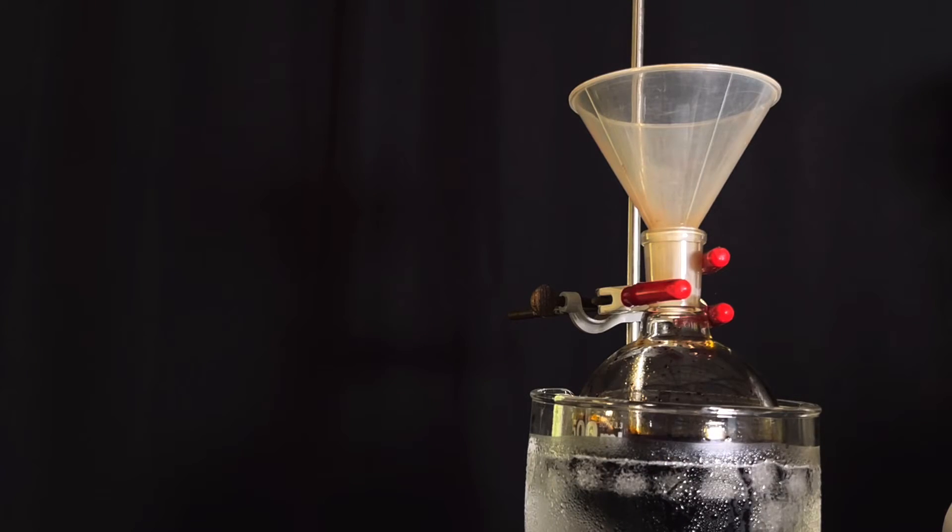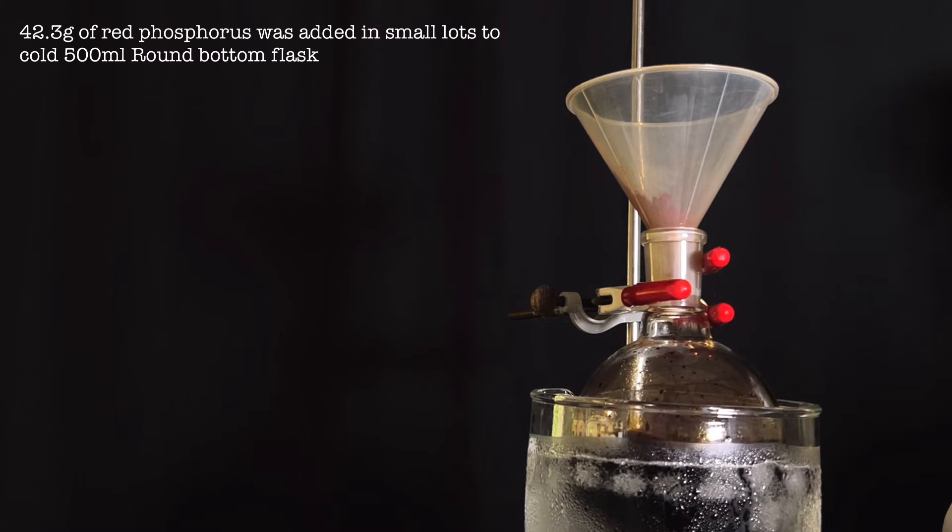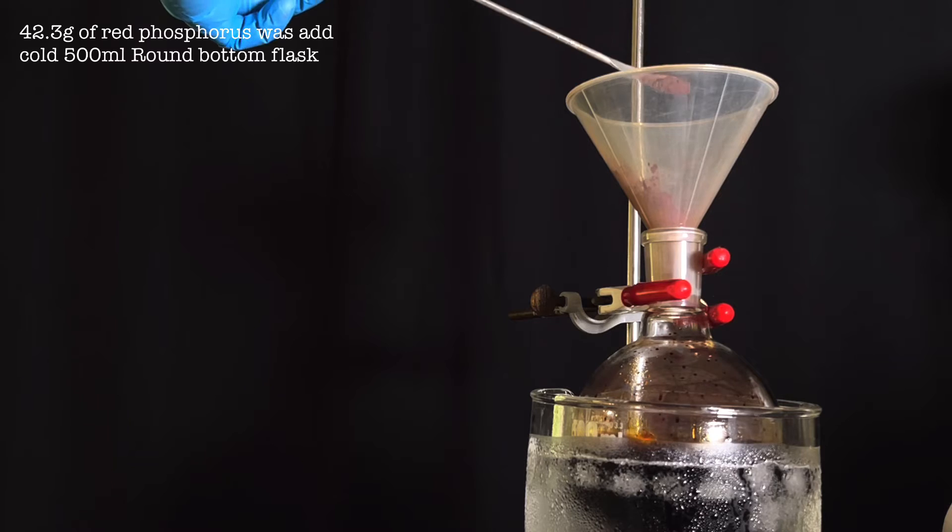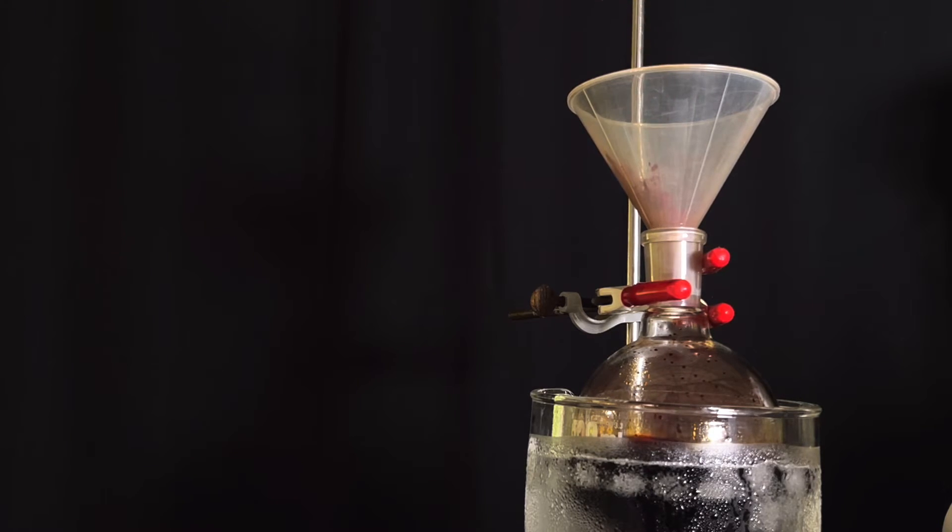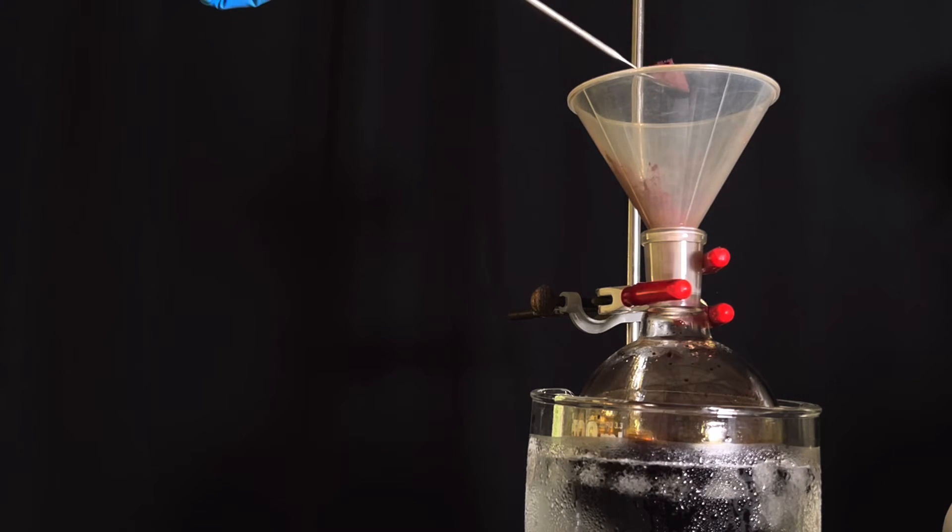Next we start adding the red phosphorus in small scoops at a time. This will immediately start the reaction and the reaction is exothermic. That is the reason we are using an ice bath. The boiling point of methyl iodide is 42 degrees C and is pretty volatile.